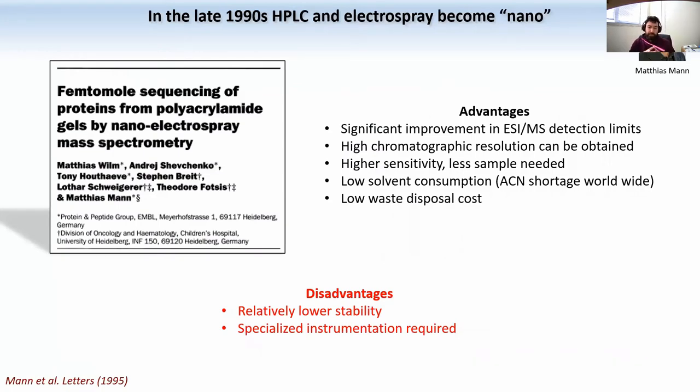Then, what happened in the late 1990s is something that seems like small incremental science, but in reality, it made a total difference, and that's how everybody uses proteomics today. In the late 1990s, people scaled down the flows of their liquid chromatography.